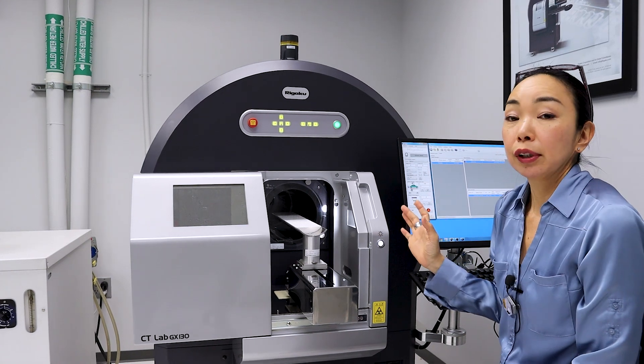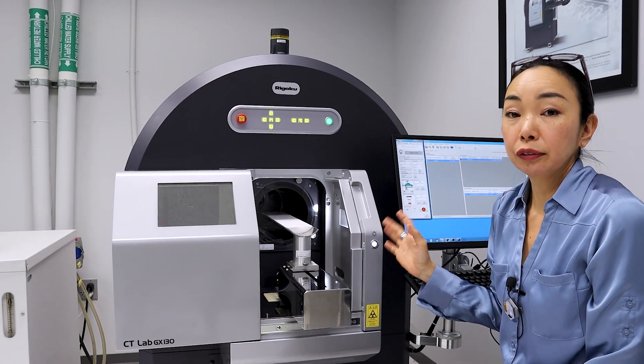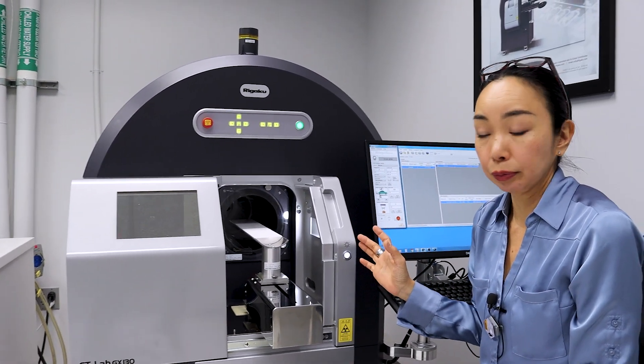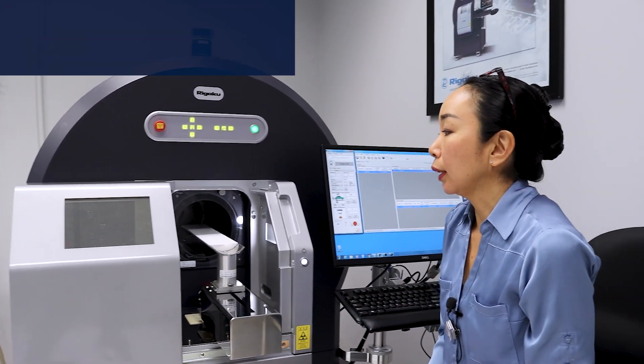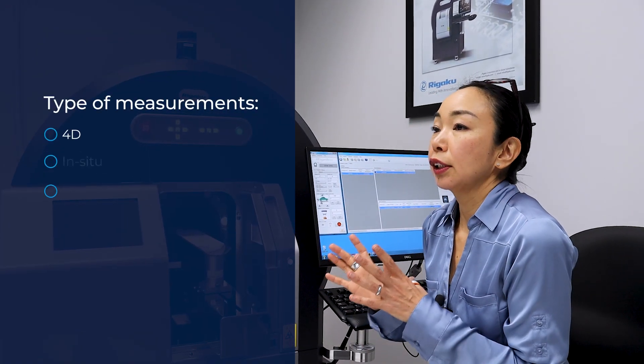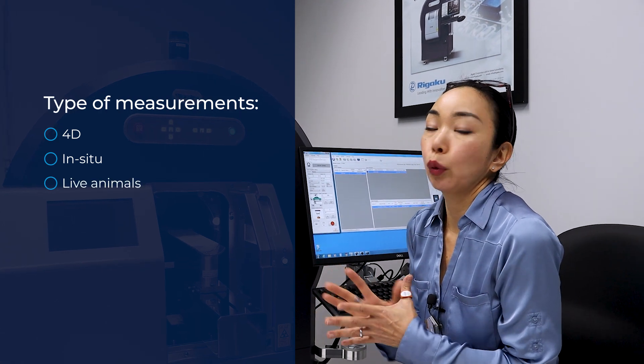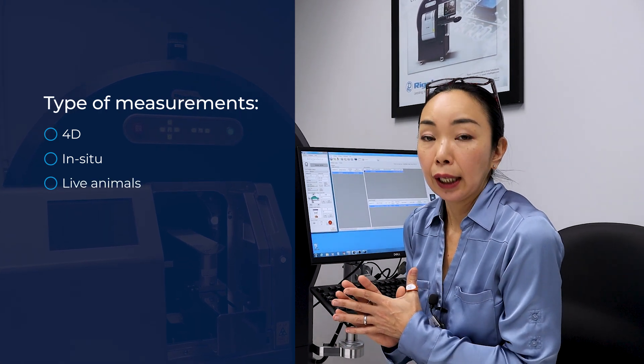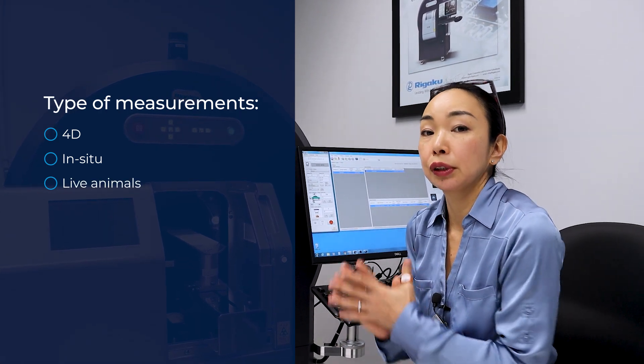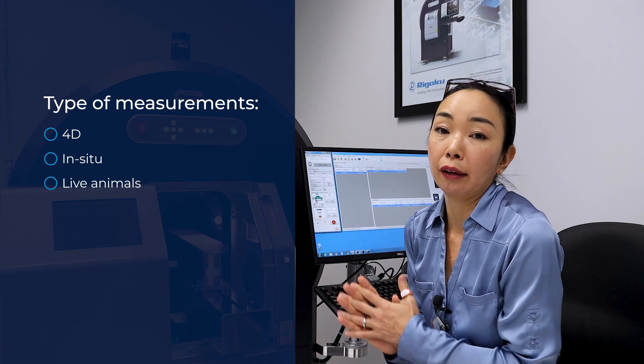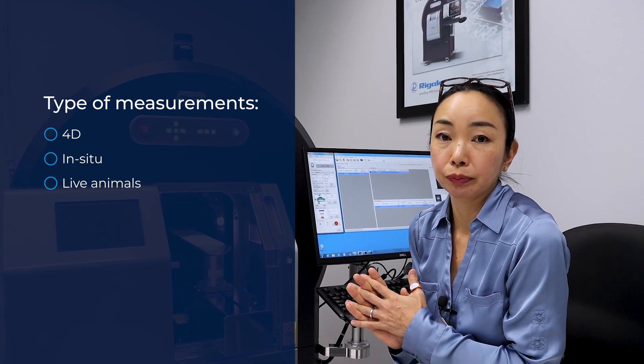Because the sample is not going to move, we can do a very fast scan, and this is very useful when you want to do 4D or in-situ measurements. And some people use this scanner to look at live animals, too.